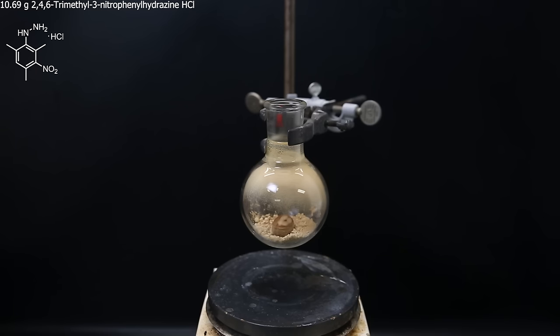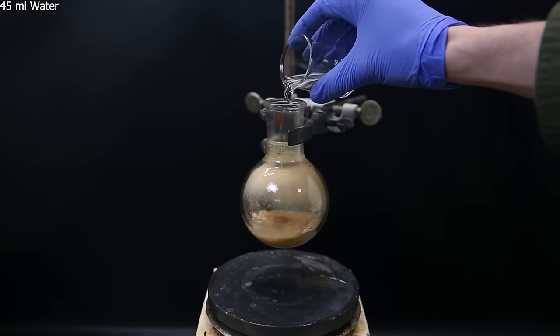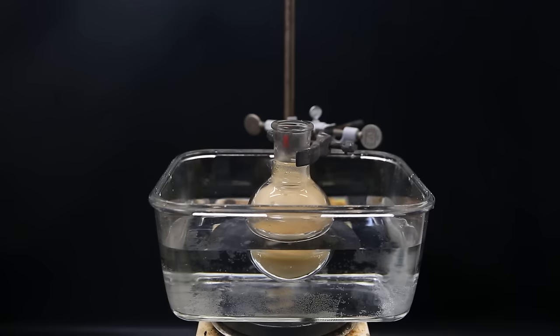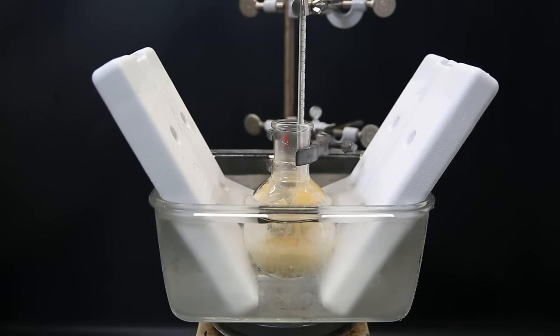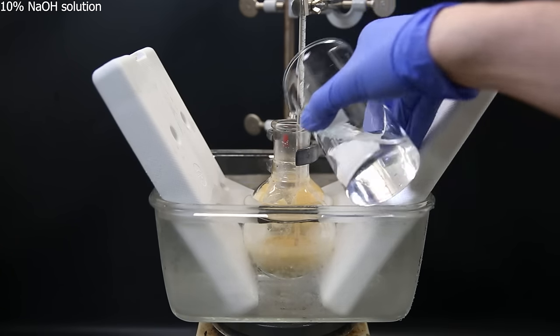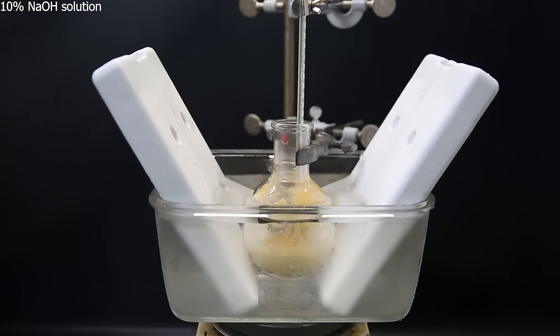So I added a big stir bar to the flask with the hydrazine salt, and add 45 mL of water to create a suspension. I moved the flask to an ice bath to cool it down to around 0 C, and added a thermometer to keep track of the temperature. I then gradually add in a 10% solution of sodium hydroxide to freebase the hydrazine.